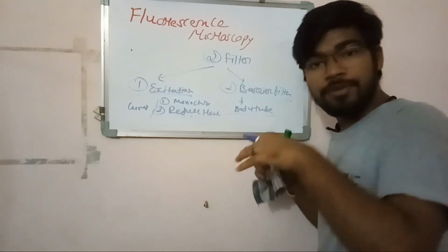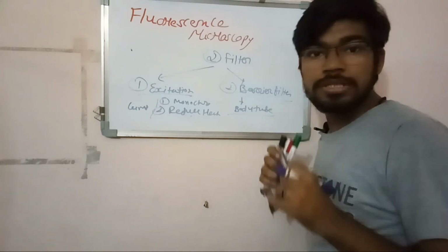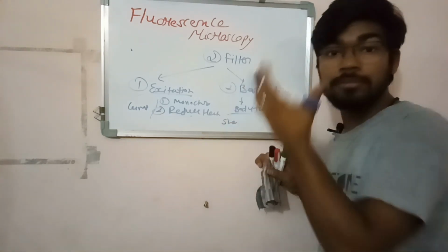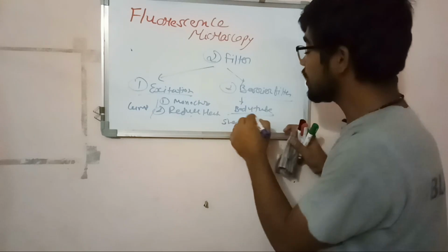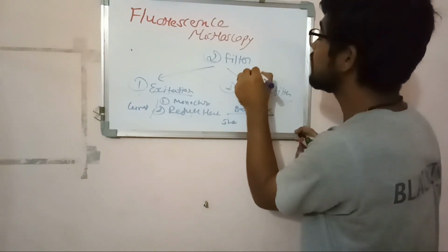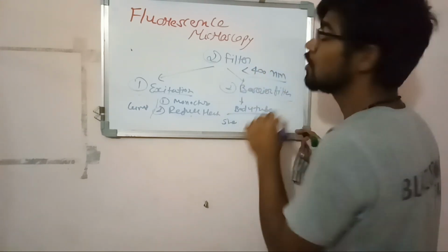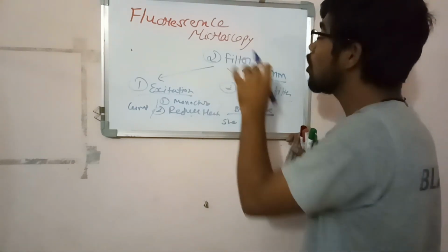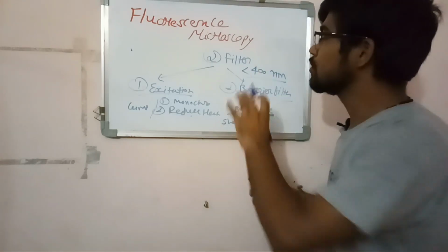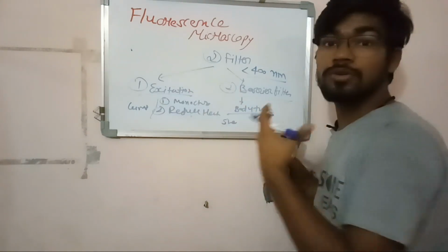After the object absorbs light and emits light into the objective lens, we are going to see the image, but if some amount of shorter wavelength light comes into our eyes, it can damage them. So it blocks the light less than 400 nanometer. The high energy light is blocked by the barrier filter, so we can see the proper image without damaging our eyes. This is the function of the filter. We also place a digital camera to see the fluorescent image.